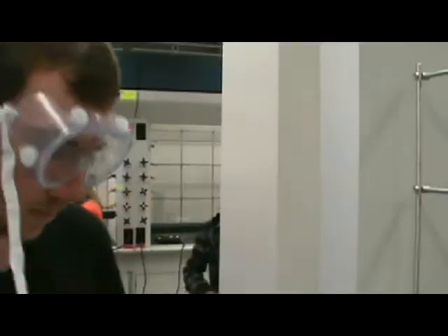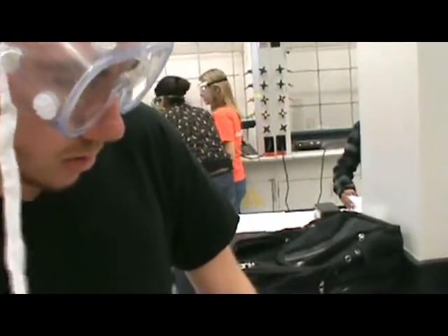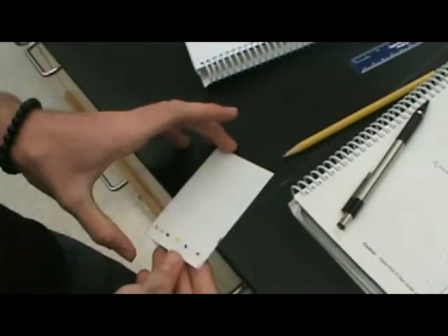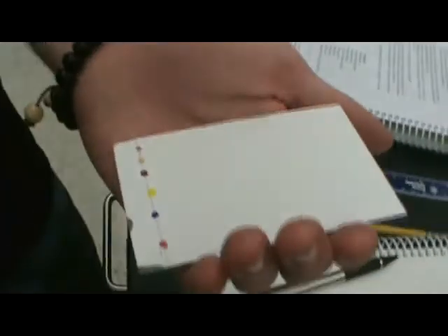Anthony, will you real quick describe the 2 kinds of chromatography we're doing right now? There's the still and then there's the motion. That's right. The first phase is stationary and the second phase is mobile. So this was the first phase where it's stationary. And we fill this beaker up with whatever Blake's going to get.